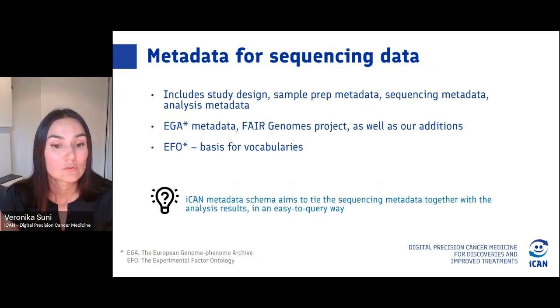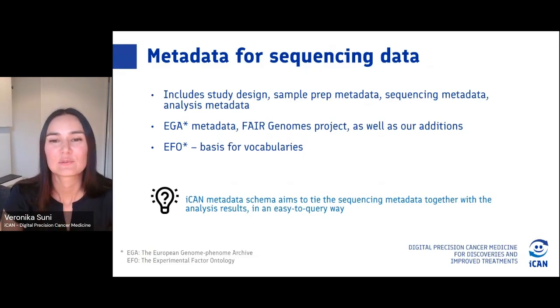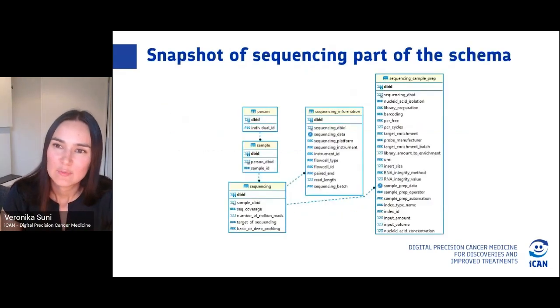And as a basis for vocabularies, we used the EFO ontology. And so we were trying to have our metadata schema tying the sequencing metadata together with the analysis results, and have it in an easy to query way. So here's a snapshot of a sequencing part of the schema.